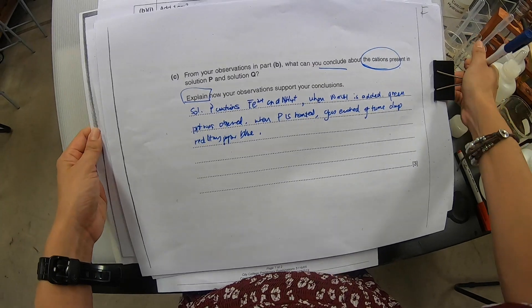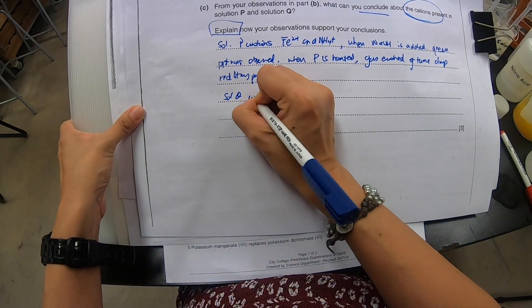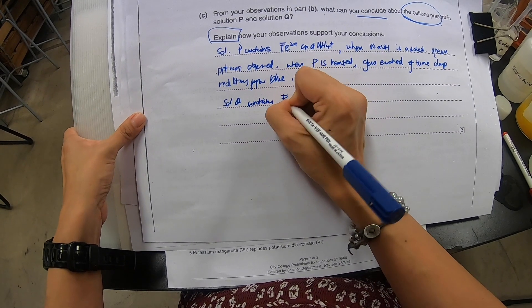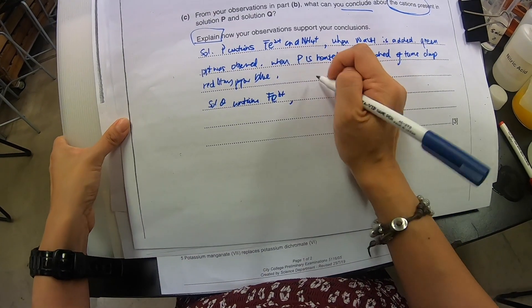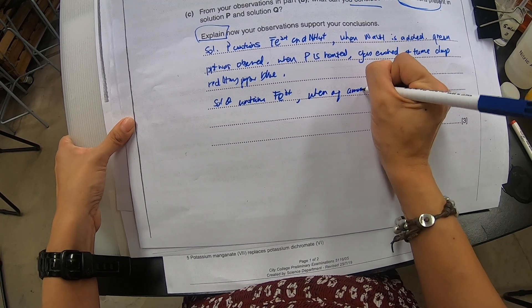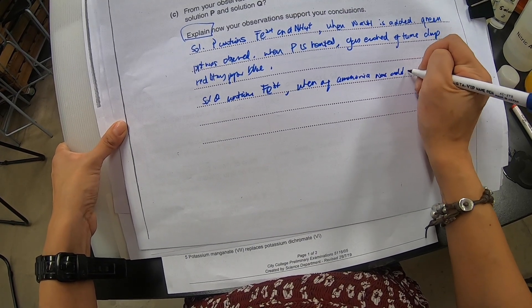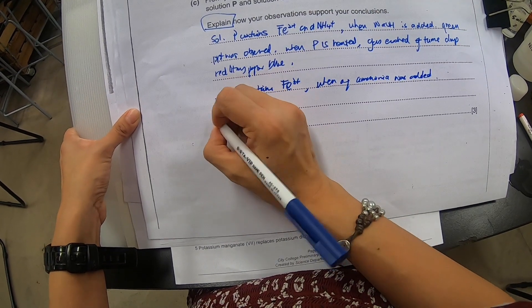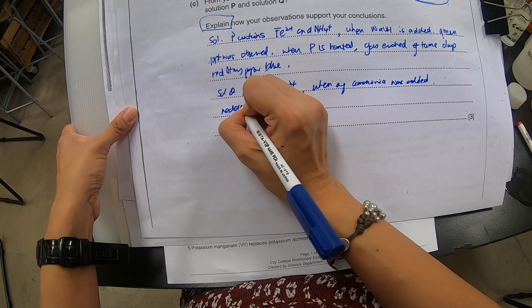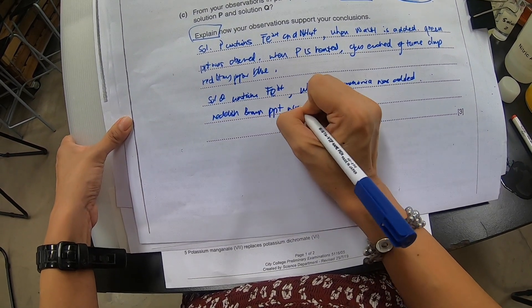Let me go back to this part and finish up this portion. Solution Q contains Fe³⁺. Why? Because when aqueous ammonia was added, a reddish brown precipitate was observed.